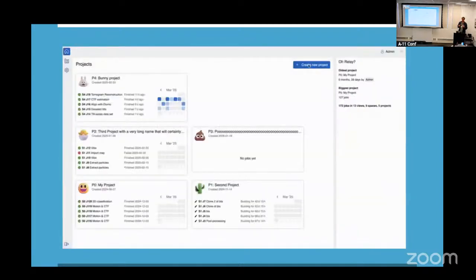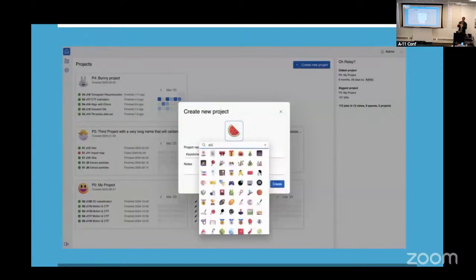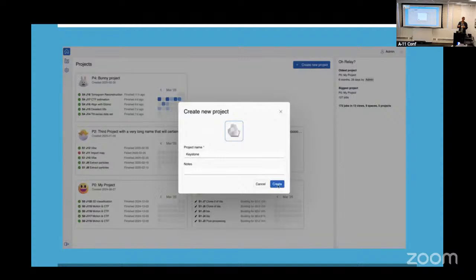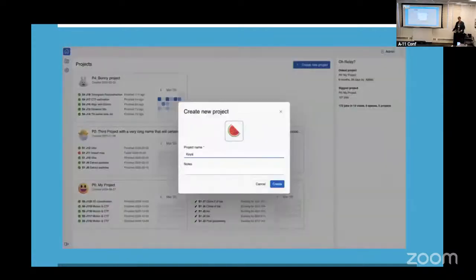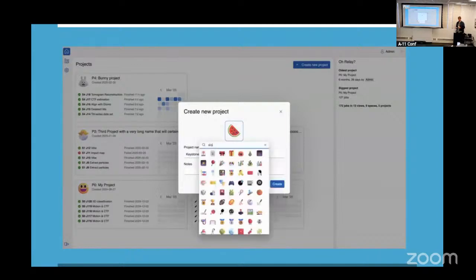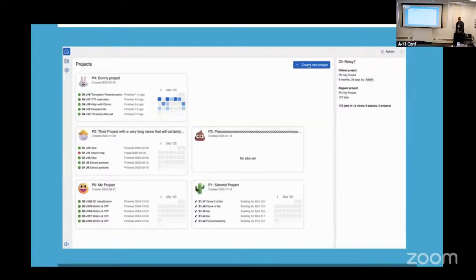We work in a pharma company. These things run for a long time, and you need to be able to organize those large-scale efforts within a system like this. And so this might be something like a PI's long-running interest in a particular biological system would be under one project. And so here, Dimitri makes a project.